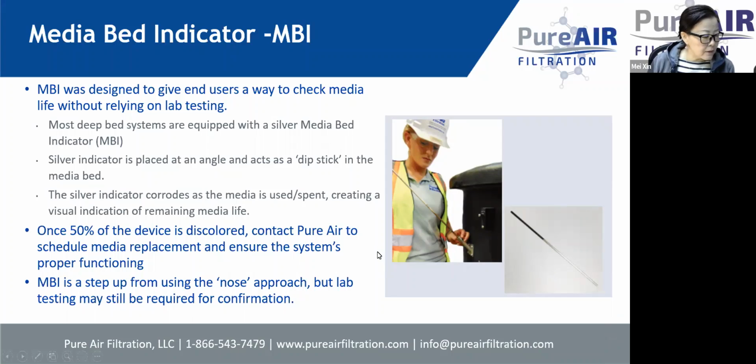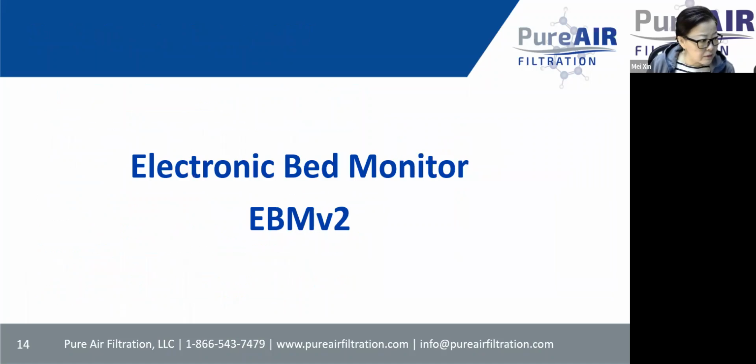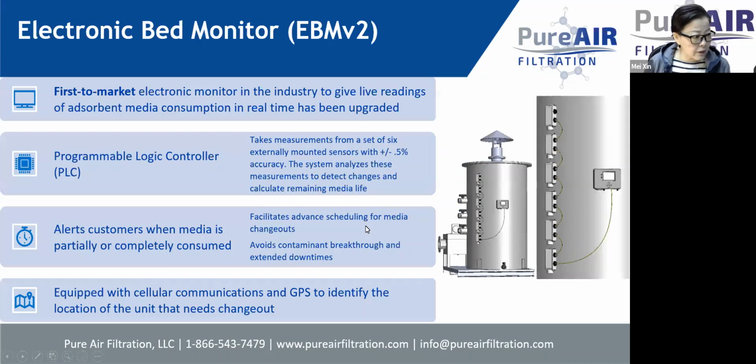Next, we talked about this media bed indicator, which is on site, but it's more like a combined qualitative and quantitative method. Next, I'm going to talk about the electronic bed monitor. We have a version 2 upgraded version.